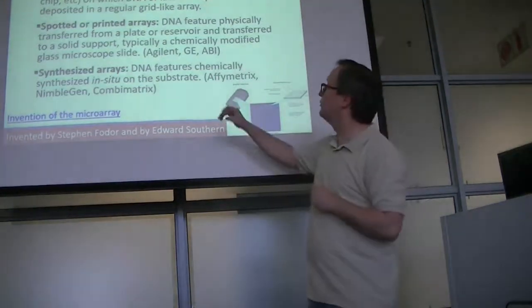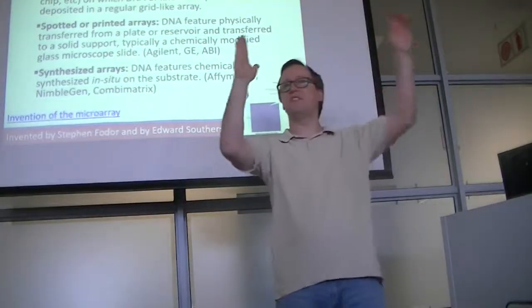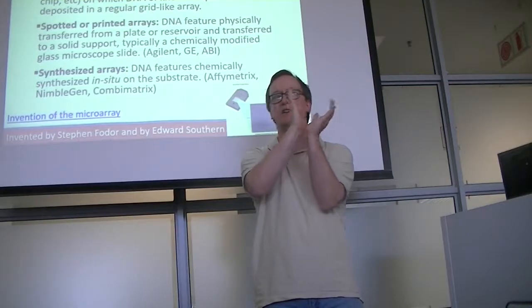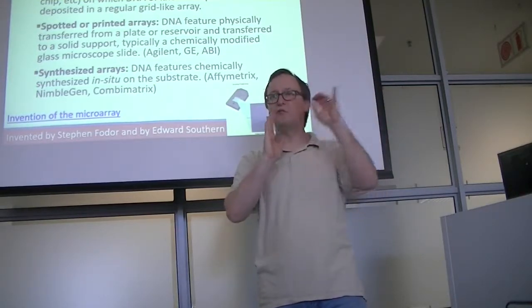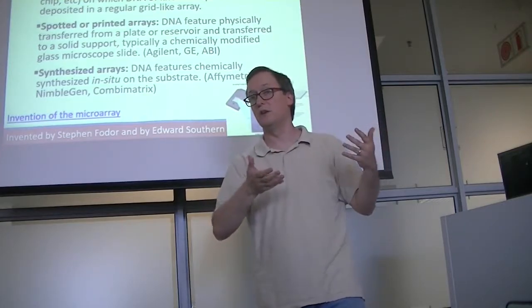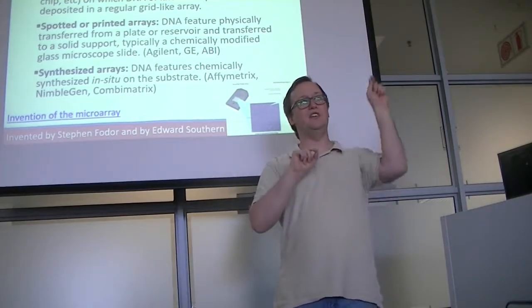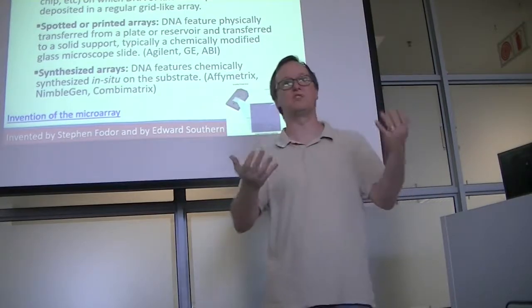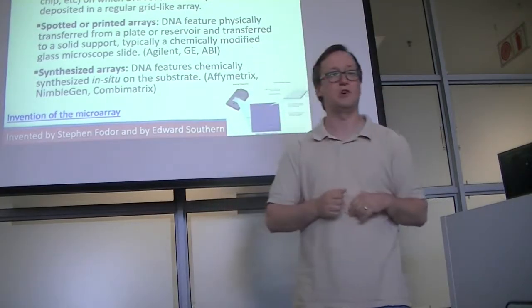All right, so if you have 100,000 x and y coordinates on these plots, you would have 100,000 different transcripts that were getting measured, unless you had some redundancy built into it. You might imagine that you have each gene represented in two different locations on the array to help you evaluate which probes you could trust and which ones you couldn't.